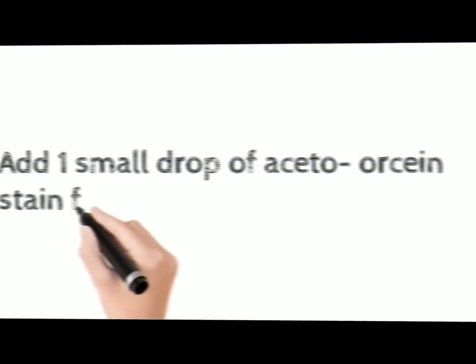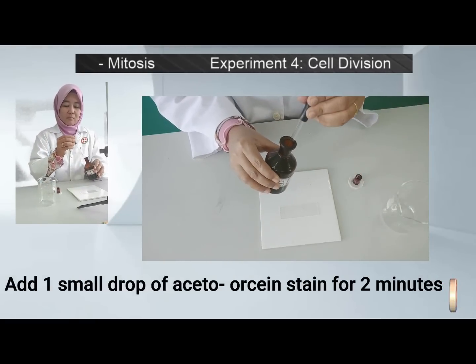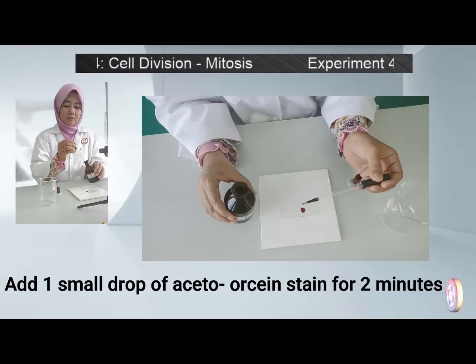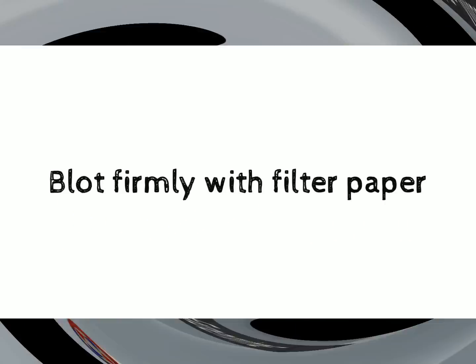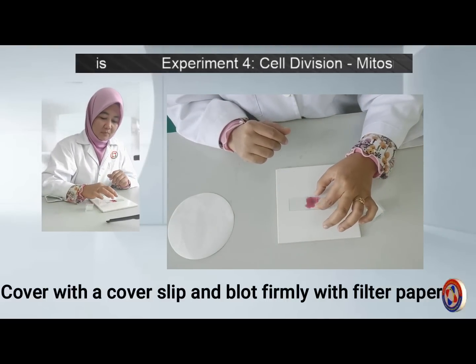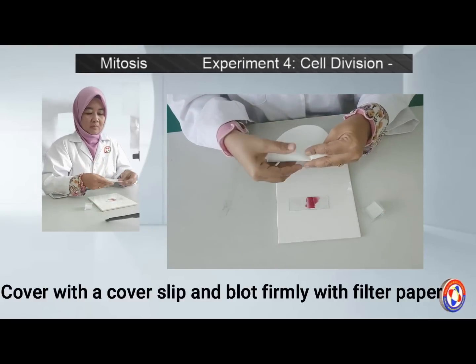Add 1 small drop of acetyl orcein and wait for 2 minutes. After 2 minutes, cover with a cover slip. Press firmly with several layers of filter paper while gently pressing to spread the root tips.